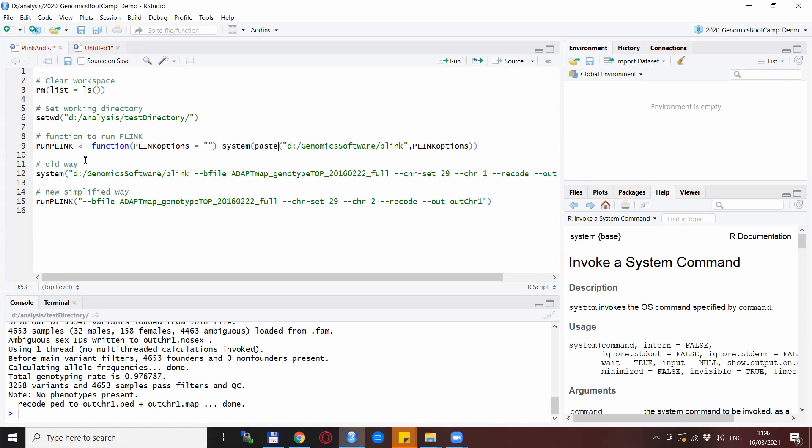One thing to take care of: the letters, so the capital and the smaller case letters matter. So whatever you defined here, it should be used also later on. So this is a function, an R function with a single function argument which I call PlinkOptions here and which is by default empty. And the whole function is really just to call the system command with the Plink executable file right now with the empty PlinkOptions.